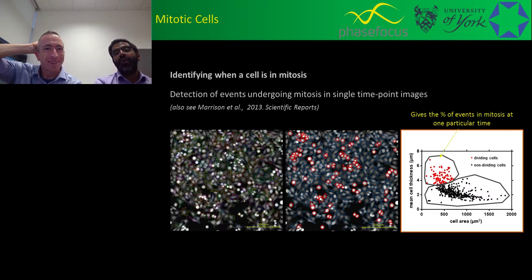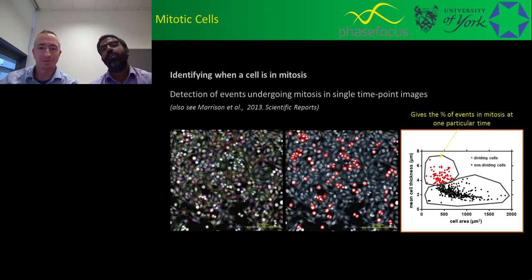Excellent. So we've seen that phenotype. When a cell is undergoing mitosis, we have this huge increase in cell thickness. And this is actually one of Peter's early publications from before I started, so I'll hand back over to you to describe this.